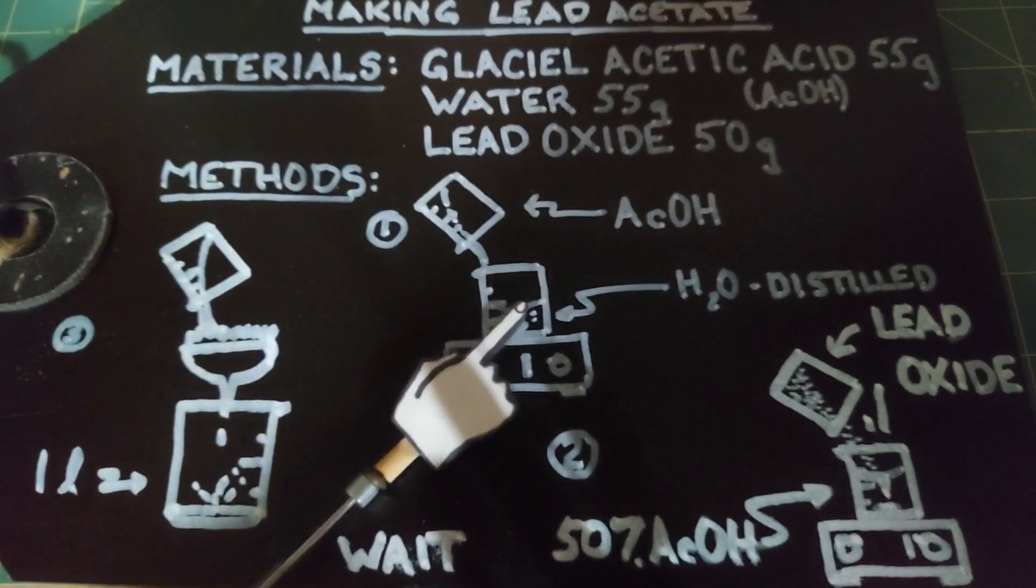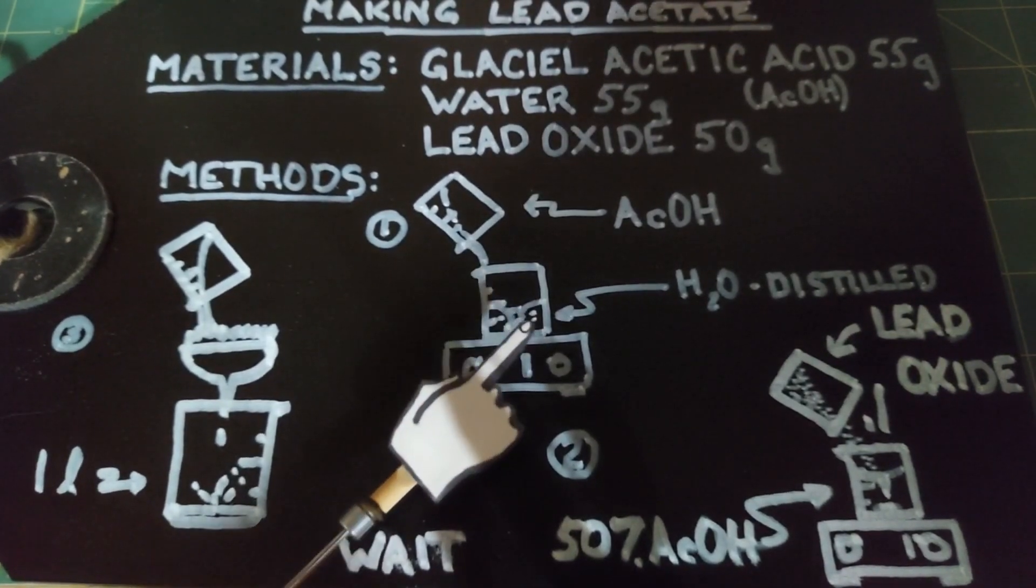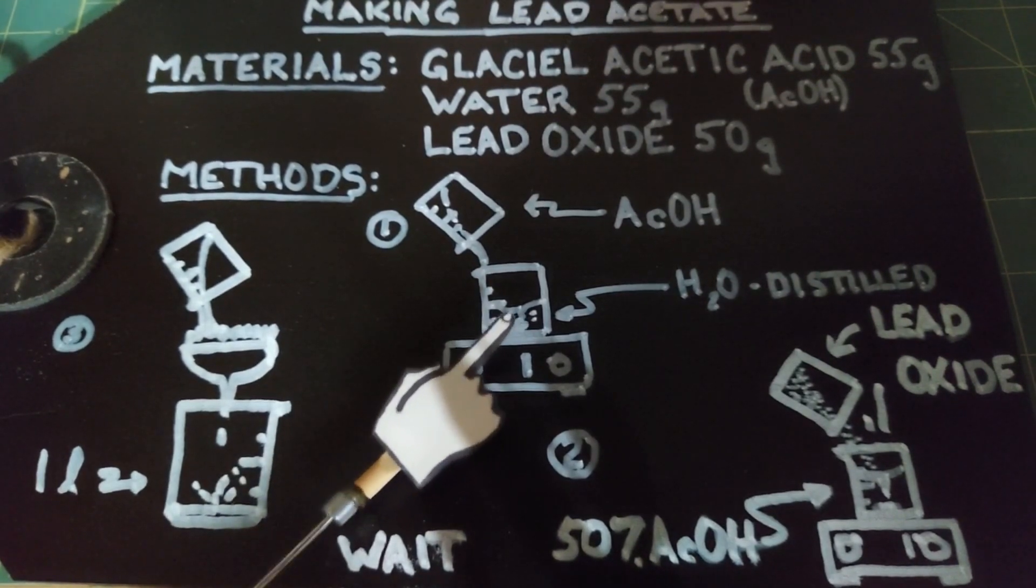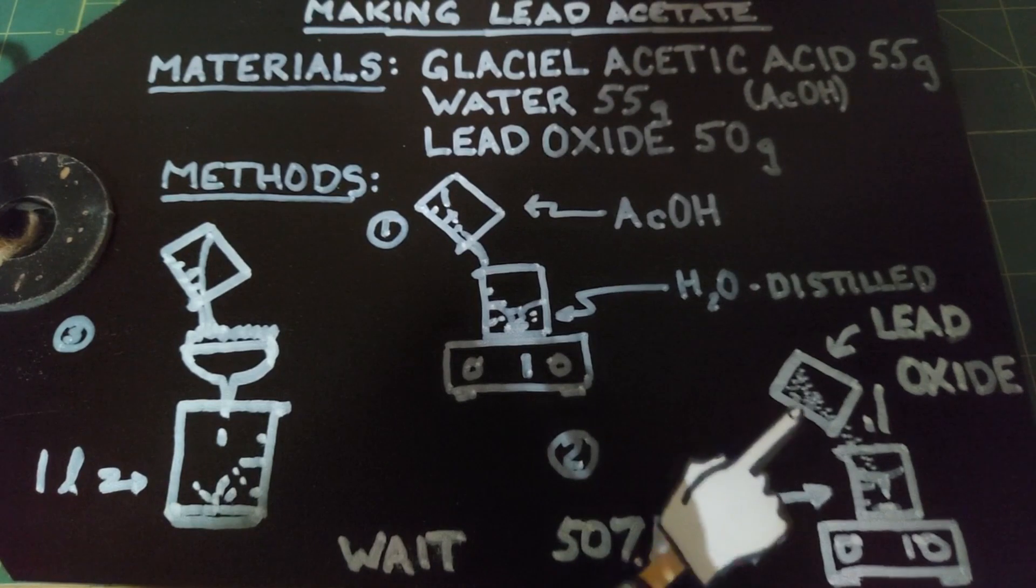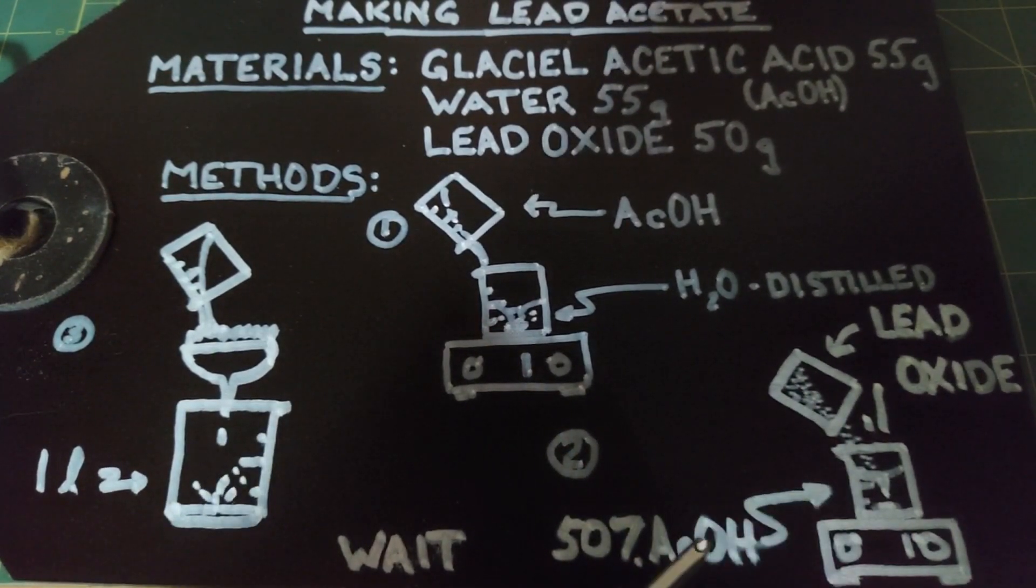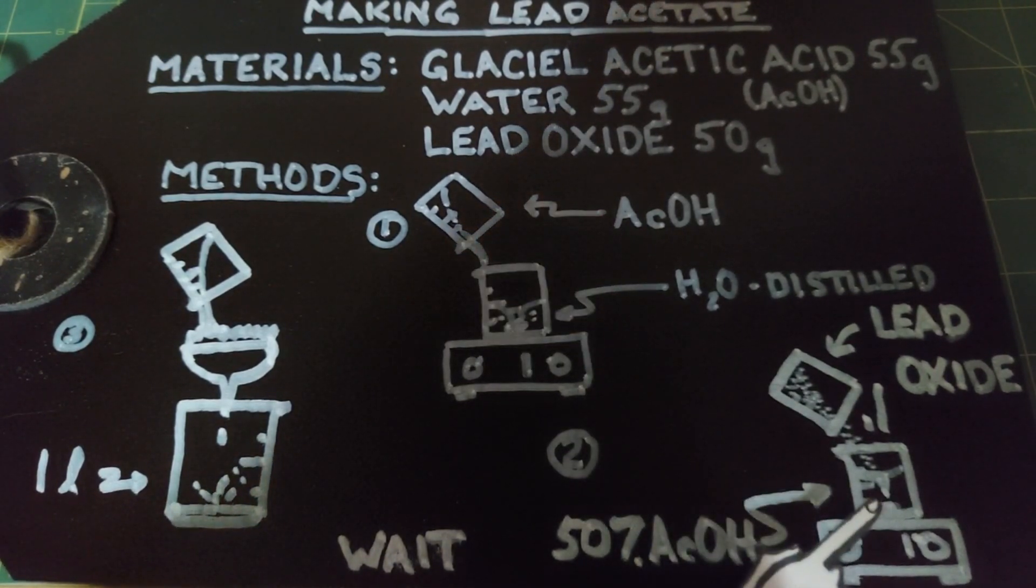For our methods, the first thing we do is put our water in a beaker. I use a stirring rod to accelerate the process of mixing and poured in the glacial acetic acid until it was mixed really well. Then I poured in the lead oxide slowly because this creates quite a bit of heat when the lead oxide goes in and continue to mix it in the 50% acetic acid solution until all the lead oxide was dissolved.